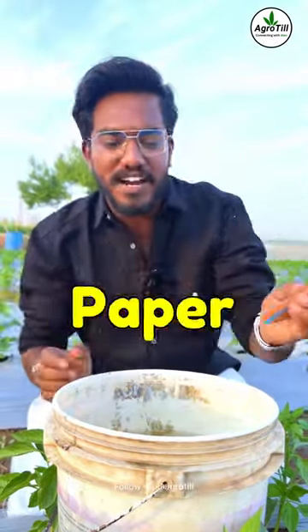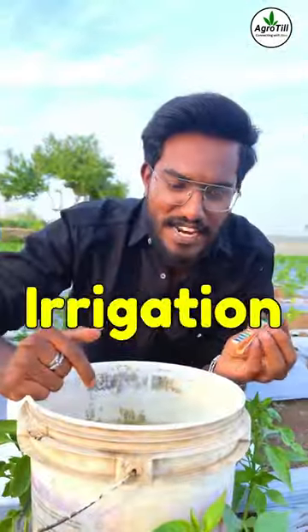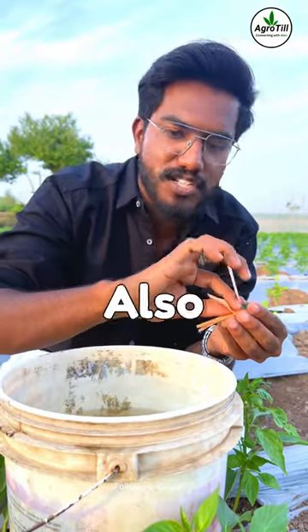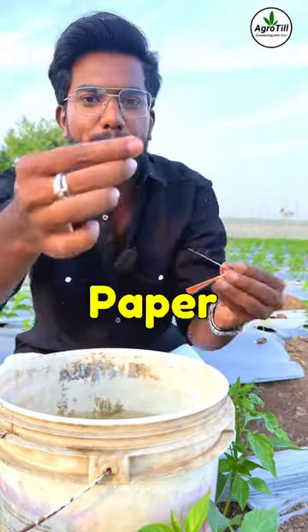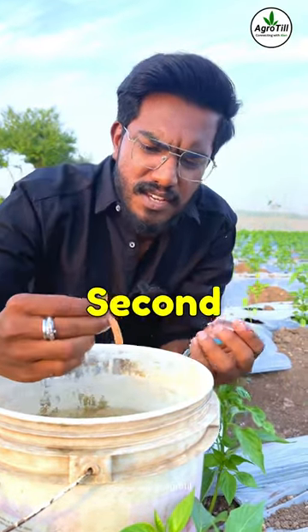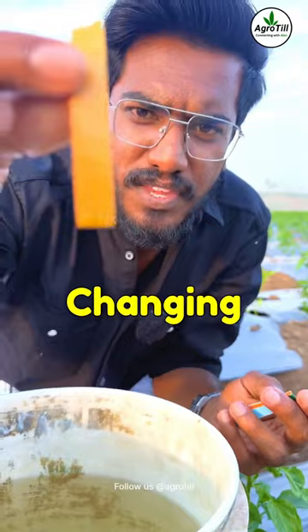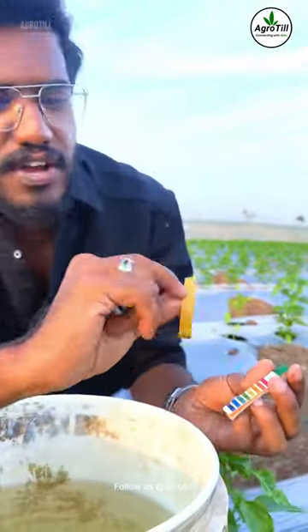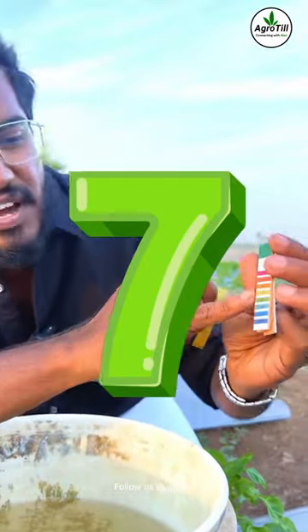I have something for you — this is litmus paper, and this is water used for irrigation. We can call this pH paper as well. Let's take a strip and dip it in the water. Just wait a second — you can see the color is changing from orange, and now it has settled to light green, which means a pH of 7.